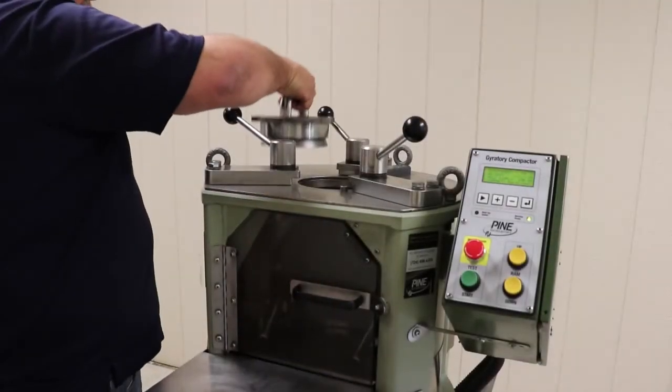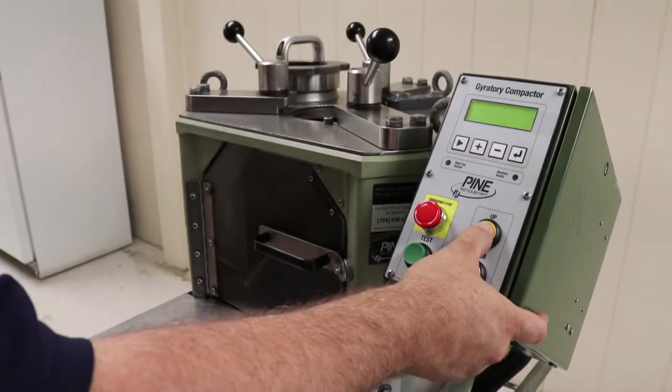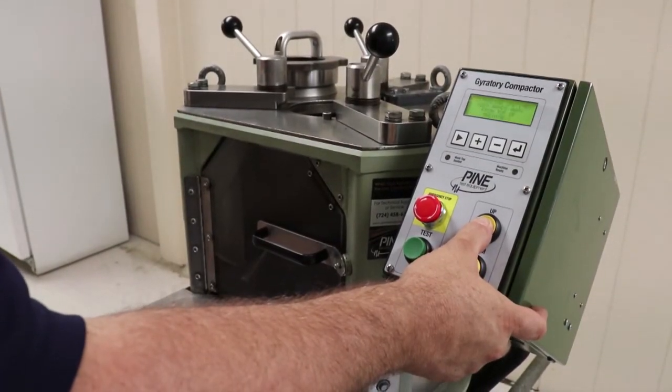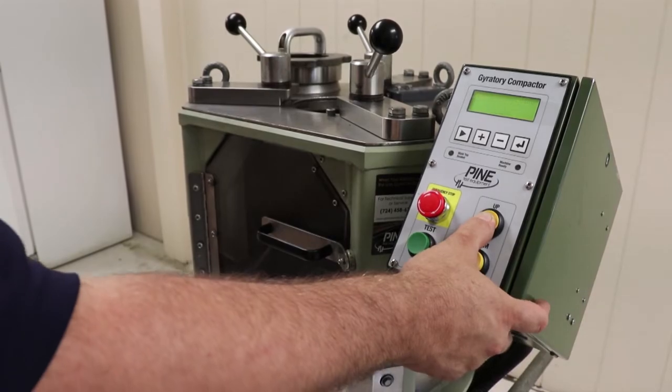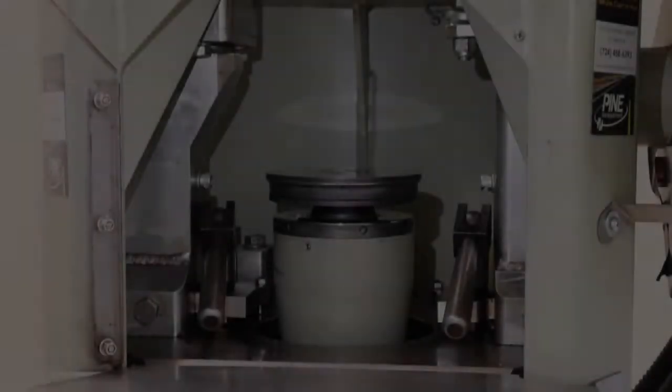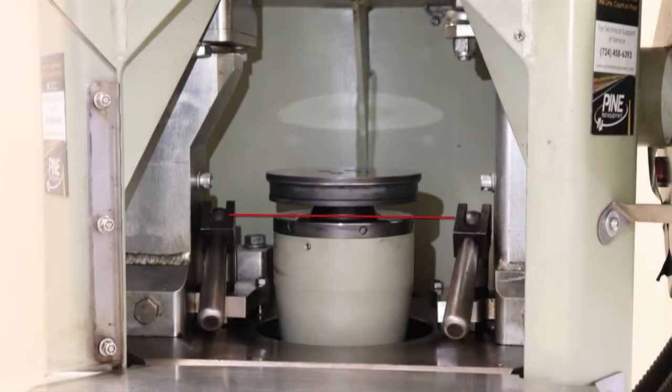You will then remove the mold top. With the compaction chamber door closed, depress the RAM UP button to raise the RAM until the gap in the RAM foot assembly is level with the top of the mold clamp handles.